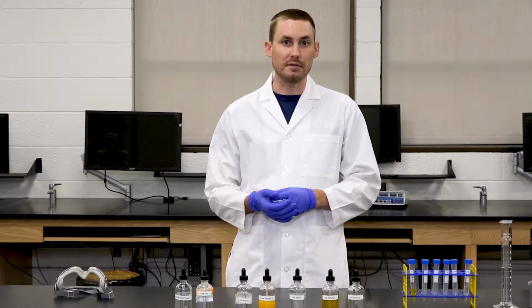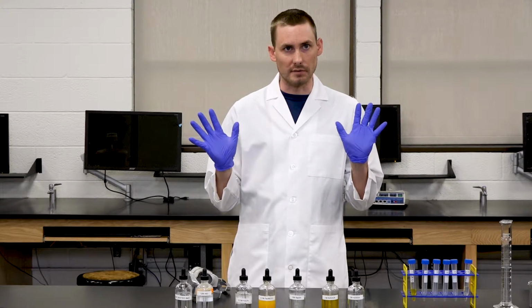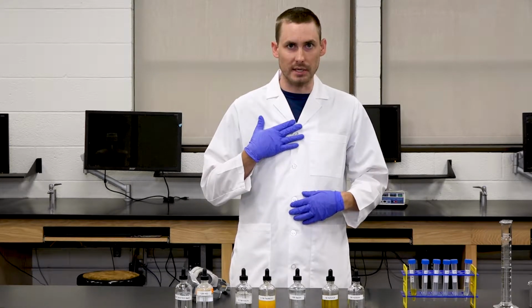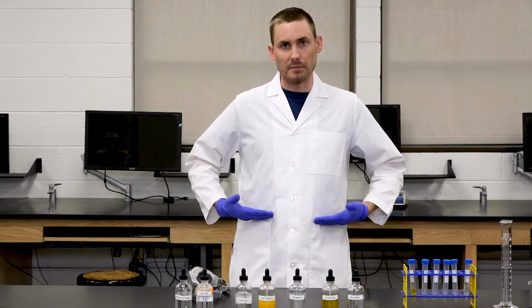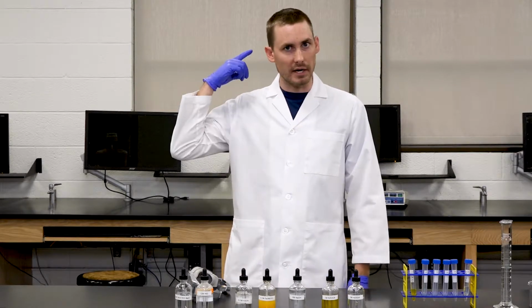So as a reminder for safety, we want to make sure that we're wearing our goggles, we're wearing our gloves. We have a lab coat that's completely buttoned up. No skin is uncovered from the waist down. That includes long pants and closed-toed shoes, and that your hair is tied back if you have long hair.